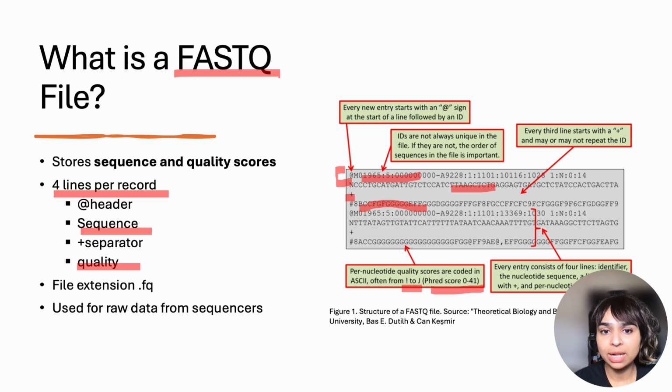And these FASTQ files often come with an extension of .fastq or .fq, and they are commonly used as input for QC tools, aligners, or assemblers in downstream analysis.